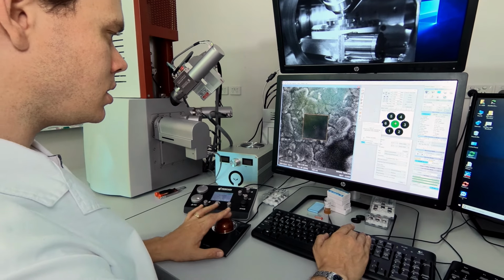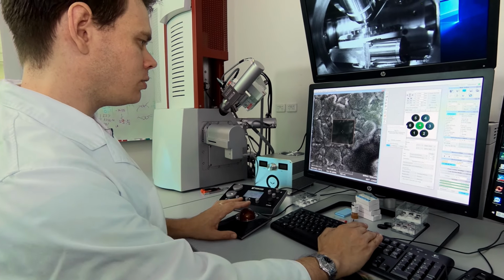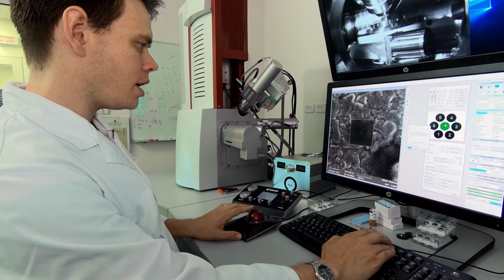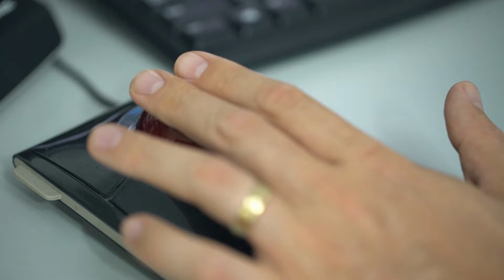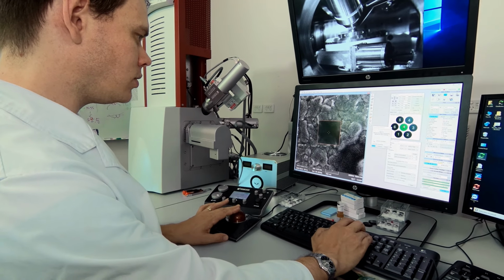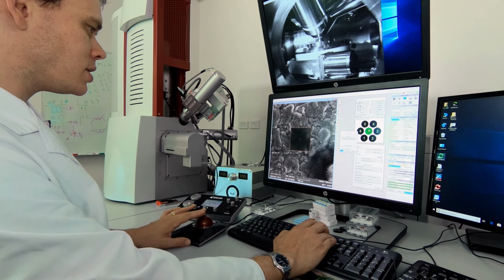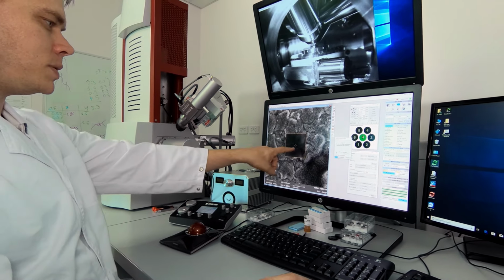It's worse. Okay, and we do this in an iterative fashion, so we're going to correct for the X now that we've mostly fixed the Y. This can be quite fiddly and can take quite a fair bit of time to do. And we can see there's a little bit of carbon contamination in the beam as well, or coming underneath the beam, because this area has turned black.